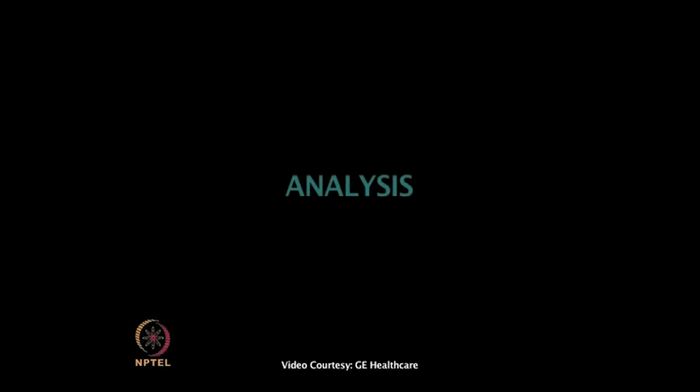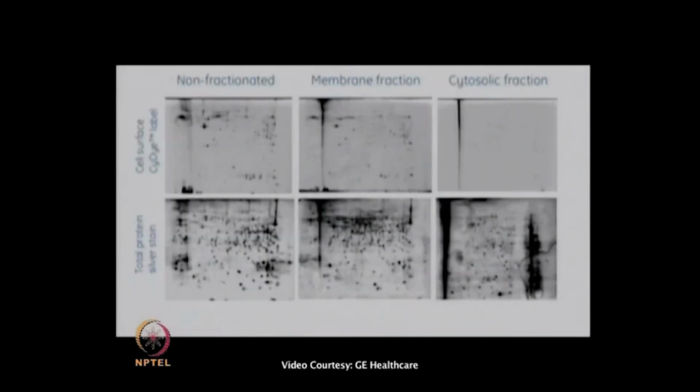The result from this 2D gel shows high resolution of membrane proteins in the sample, even if there are some known restrictions for hydrophobic proteins to be detected in a 2D gel. The results show many new cell surface label spots, shown here in red, that are not detected using the standard labeling protocol, shown here in green. These results show that the cell surface labeling protocol is highly specific for labeling cell surface proteins. Since cell surface proteins are exclusively labeled, they are more easily visualized and attenuation by abundant cytosolic proteins is avoided.